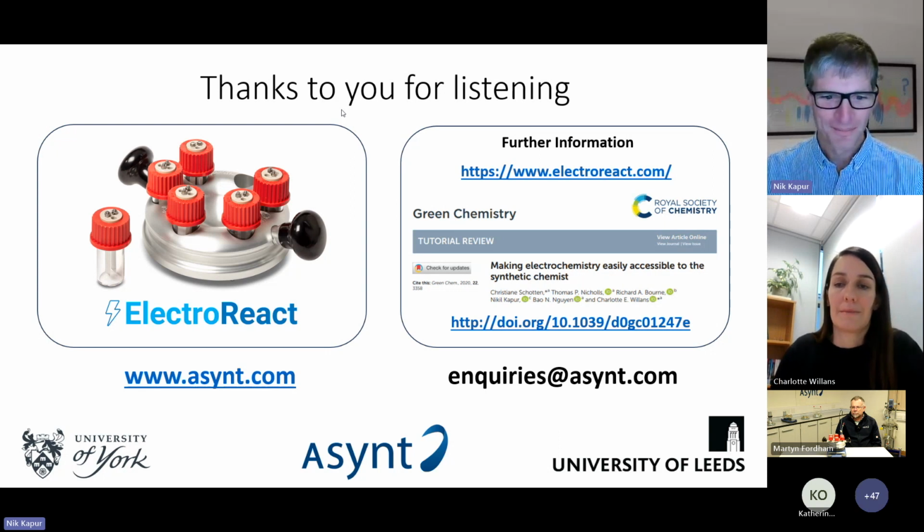So whether it would be possible or not to plate those, I don't know, but that's maybe a discussion for a different day. Yeah, certainly for all the chemistry we've done, you would have to have your solution right up at the cap for that to happen. We've never seen contamination, and we have done reactions with stainless steel electrodes, so we know what that would look like, and we've never seen contamination from that stainless steel.